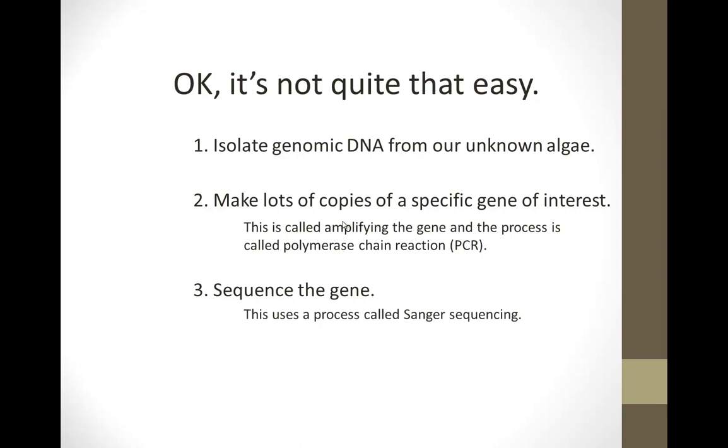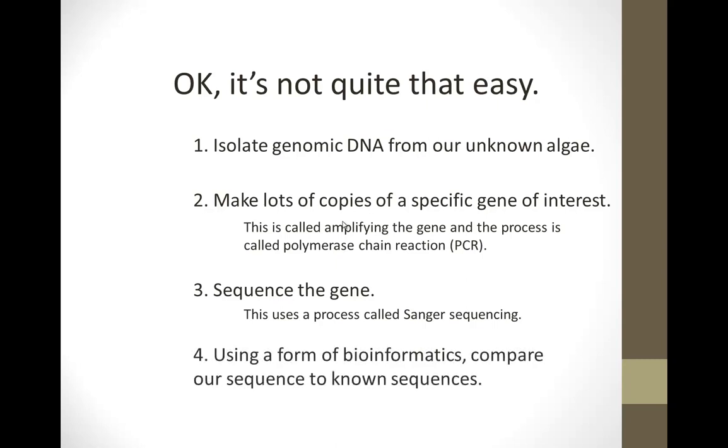We're going to use a process that's really a modified Sanger sequencing, and there will be a video in the future about that. Then finally, once we've got our sequence back from that site, we will use a form of bioinformatics to compare our sequence to known sequences in the database. And that should give us our answer as to what kind of algae it is.